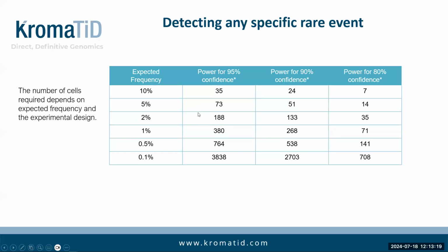So for example, probably our most common requested amount at 100 cells puts you between 2 and 5% at a 95% confidence interval. And then 200 cells puts you between 1 to 2% at a 95% confidence interval. So this allows you to determine, along again with your other data and any requests by collaborators or regulated bodies, to establish a level of analysis.